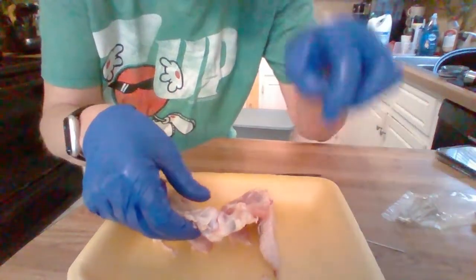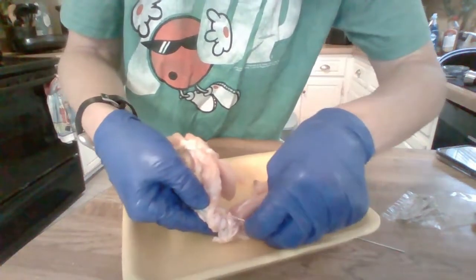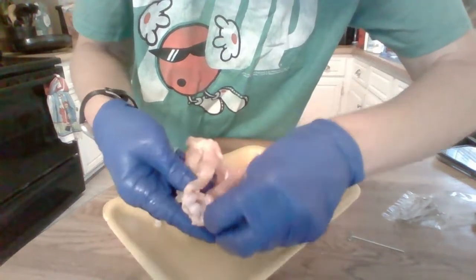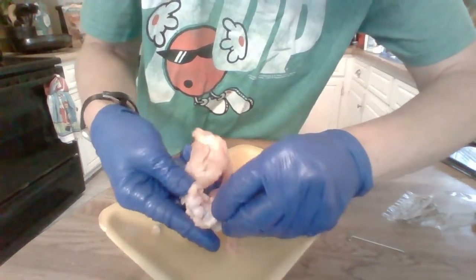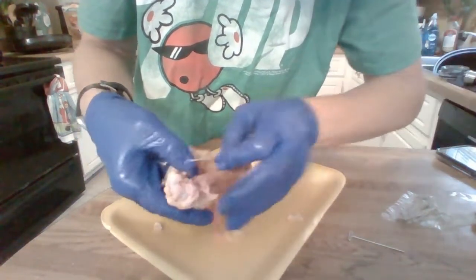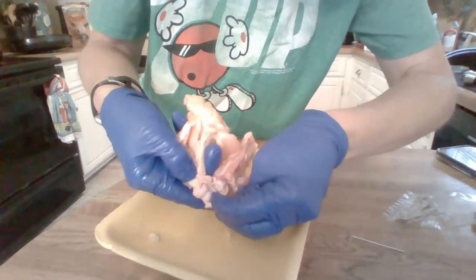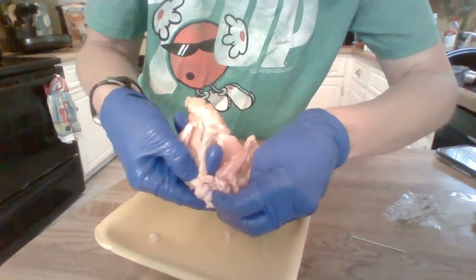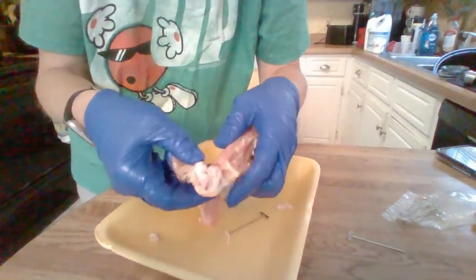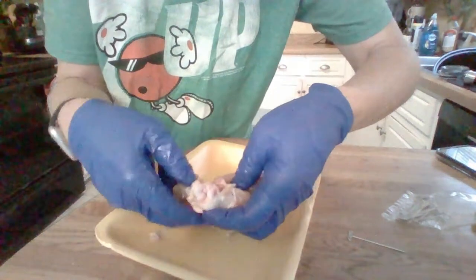The synovial membrane, I had kind of a hard time seeing. Hopefully you can see right here. I think I clipped a little too much, but there's a little membrane. There we go. Membrane right here that's around. Distort even more. So here's the membrane, the synovial membrane. It helps contain the synovial fluid that would be inside that membrane. And it's just that synovial fluid inside that membrane that helps to lubricate the bone.